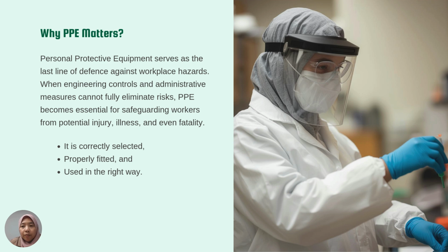The effectiveness of PPE depends entirely on correct selection and proper use. If you select the wrong type of PPE, you yourself are vulnerable to serious harm. That's why PPE only works if it is correctly selected, properly fitted, and used in the right way.